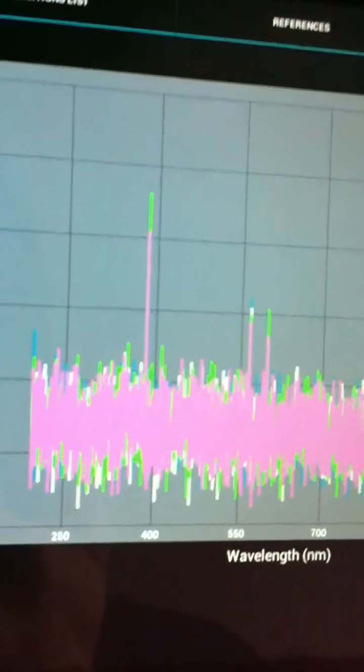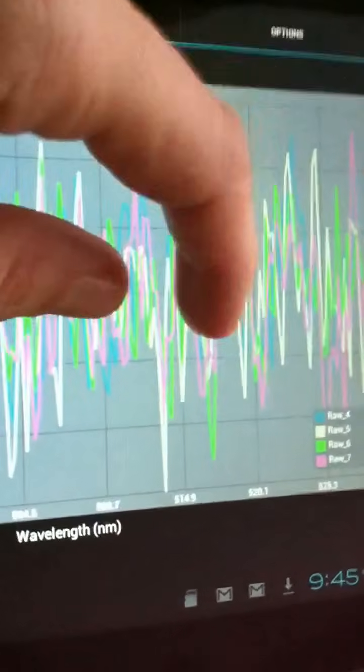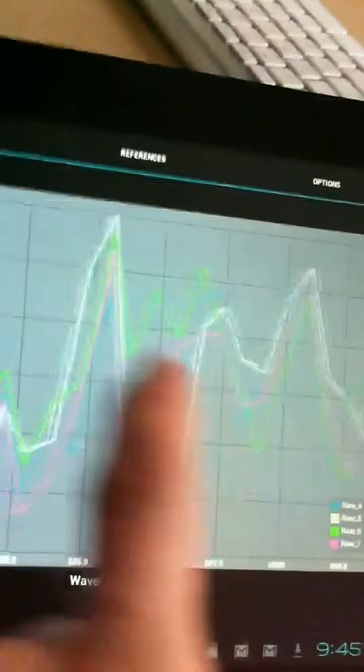As you can see, every acquisition has its own color associated with it, and a legend here at the bottom that gives you the name of the acquisition and the color as well. One of the nice things about the graph is that you can zoom in on the data to view it in greater detail. You can also zoom out.